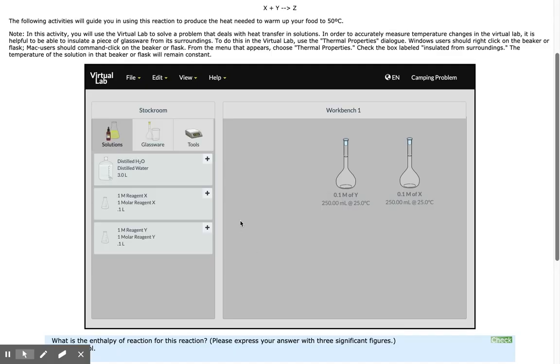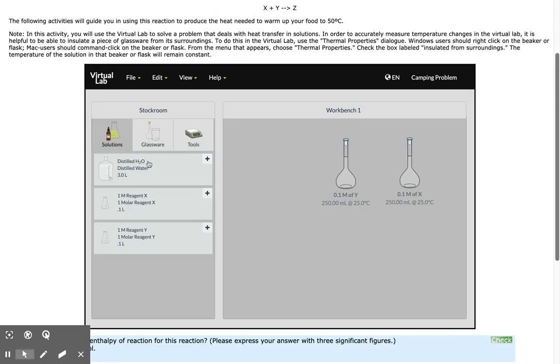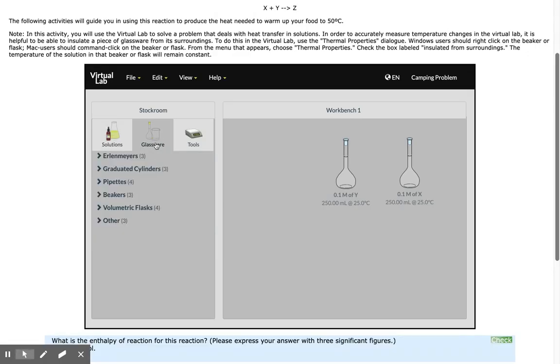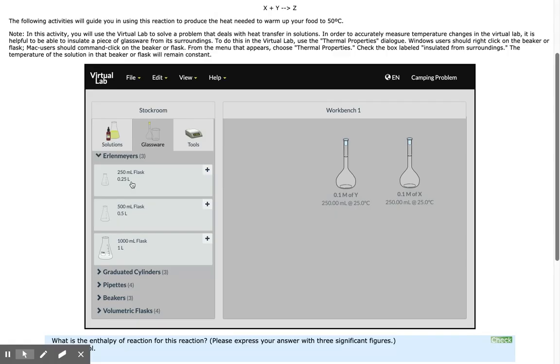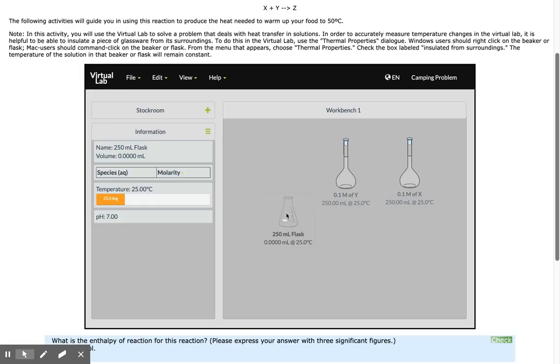Now I'm ready to conduct enthalpy measurements. I'm going to the stock room to get a 250 milliliter Erlenmeyer flask. This will be my reaction chamber.